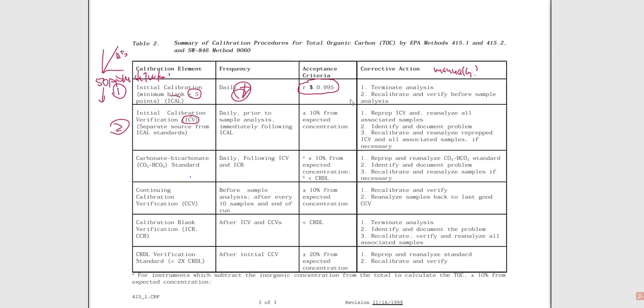It's still present. We're still diluting maybe the proper way. Maybe my pipetting is on task. Maybe I have double checked my lines on the volumetric flask. Everything went A-OK. I'm a stellar employee. Give me a raise of 50 cents. Okay, well, if it's bad, you would never know. It doesn't really show up here. You can get a straight line, absolutely. But this straight line can be wrong because it's all bad material that you're using.